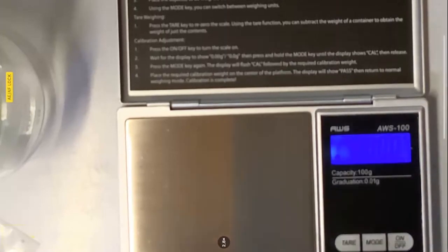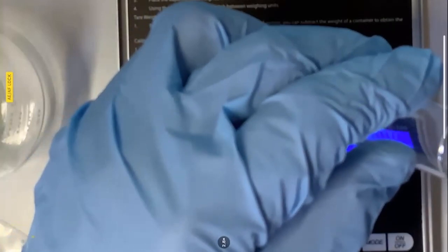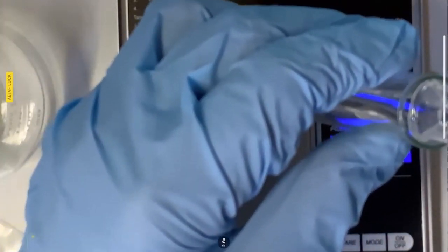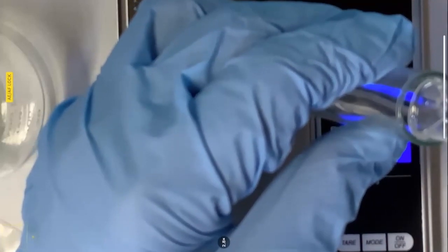So I have this, and now I'm going to pour it in my second test tube. And I'm just going to pour it in. Make sure your second test tube is clean again. And then I'm going to go ahead and do that.